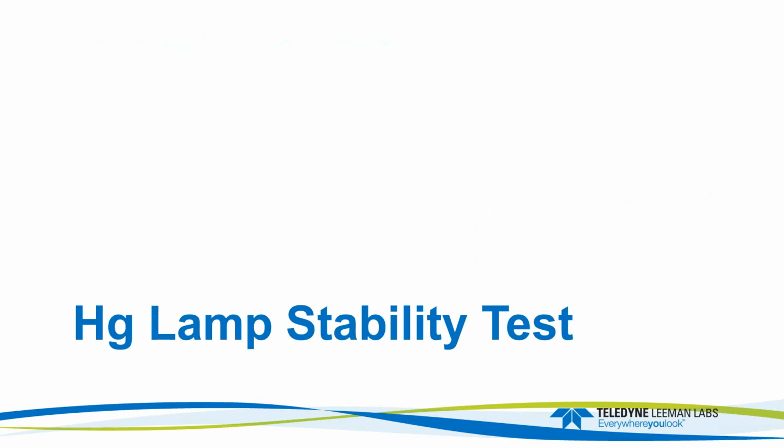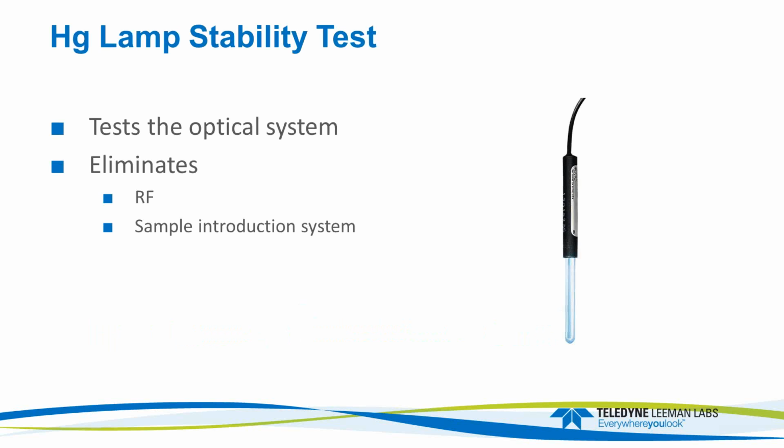So the first one that we'll look at is the mercury lamp stability test. Like I said, it tests the optical system, and it's going to eliminate the RF and the sample introduction system. On our instruments, the lamp is a pen lamp that's in there. It's always on. It doesn't move.